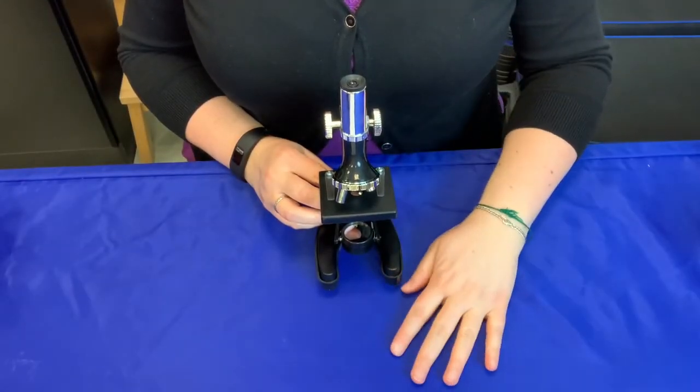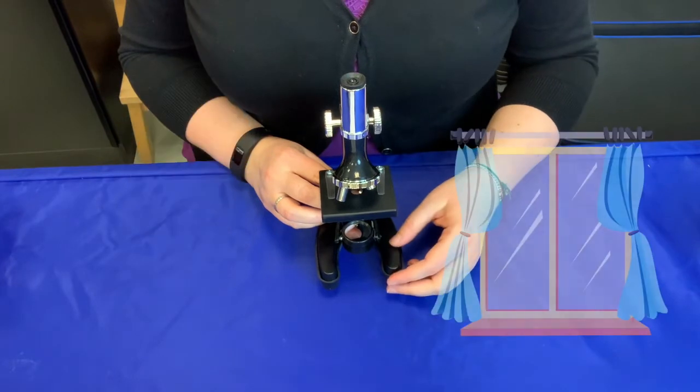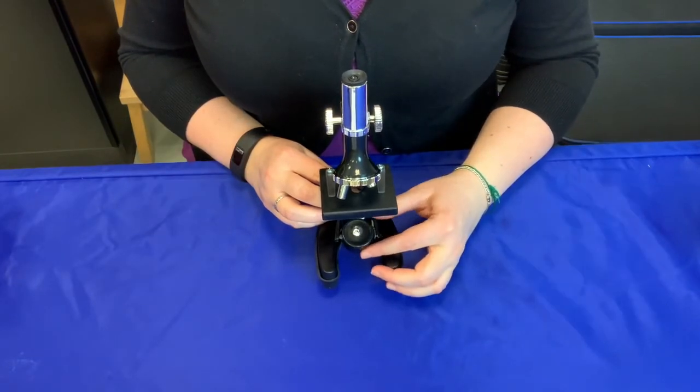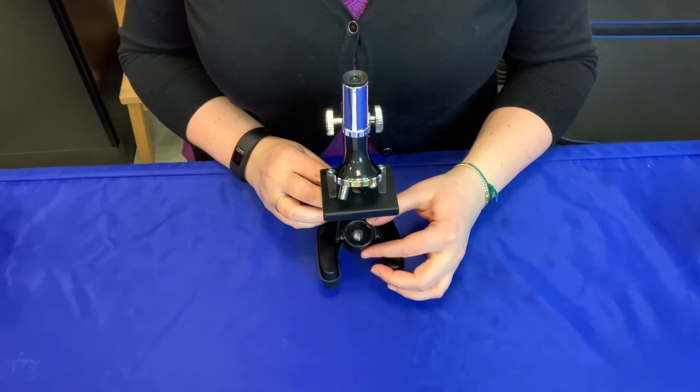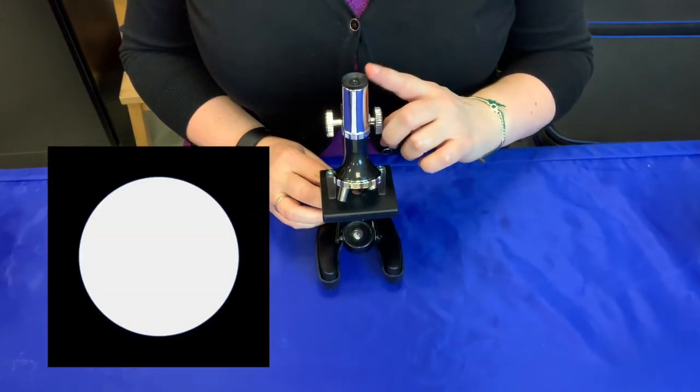Place the microscope on a flat surface near a bright light or a window. Locate the mirror down here at the bottom and adjust the angle so you see a bright circle of light when you look in the eyepiece.